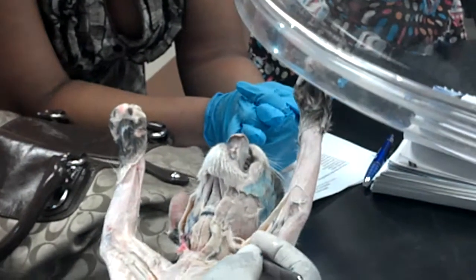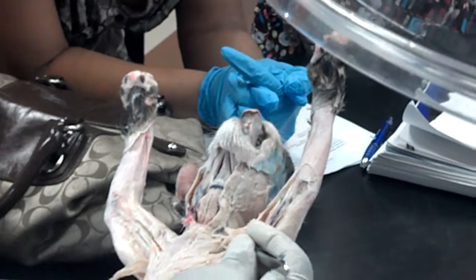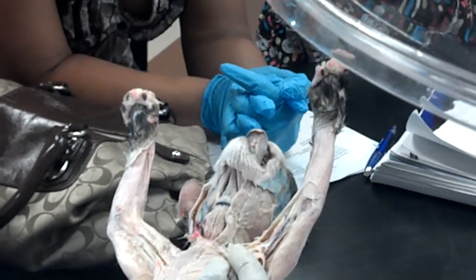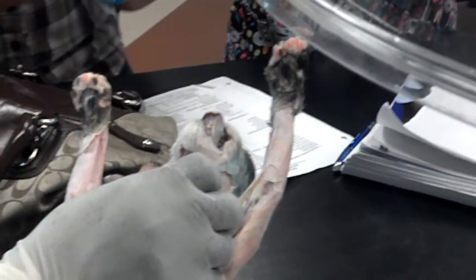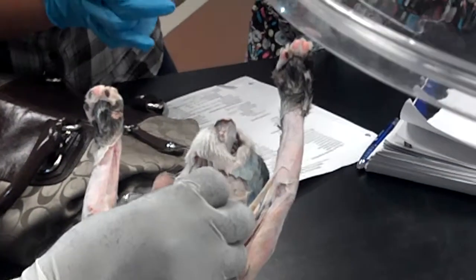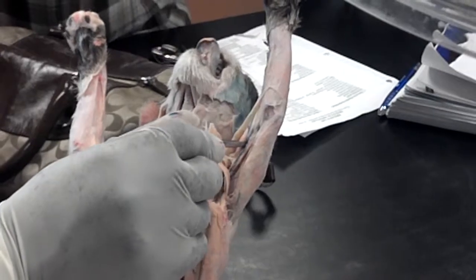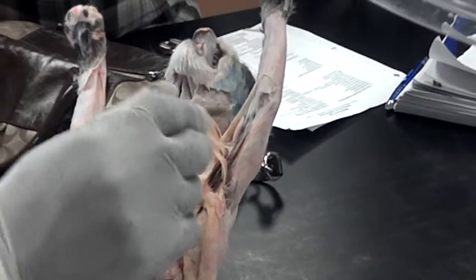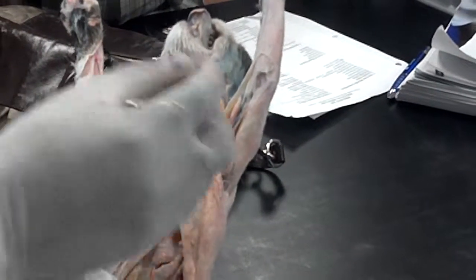This is the epitrochlearis, right? Did we say epitrochlearis on this one? This is the epitrochlearis. Once we reflect the epitrochlearis, that's when we see this biceps brachii. Okay, biceps brachii is medial, is inner side of the arm. So we have to make sure that we make a difference between this one and the brachialis on the other side.